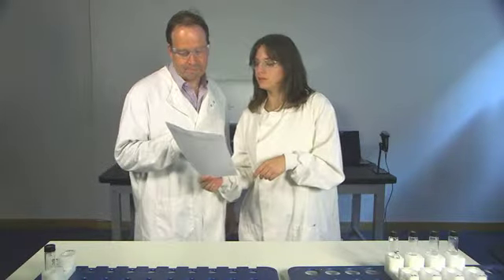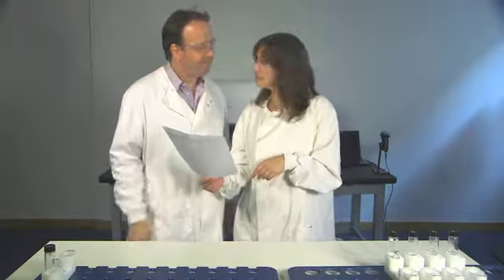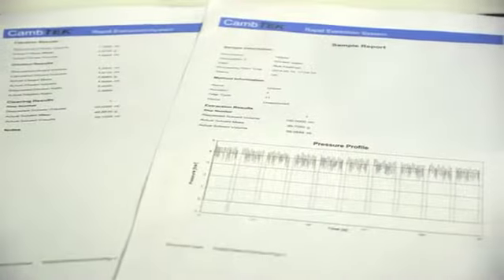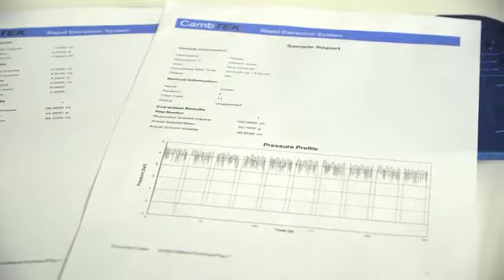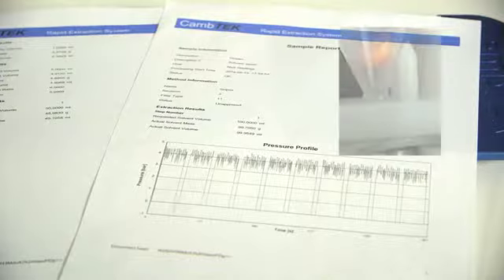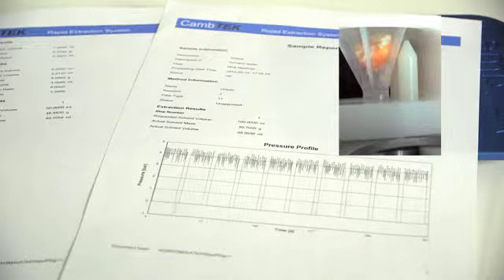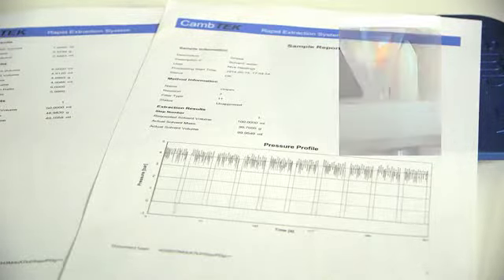One of the most important features of the RES is its ability to eliminate potential variability during testing due to analyst technique or human error. Gravimetric checking throughout ensures high repeatability, and the post-extraction report and optional video data simplifies out-of-specification investigations.